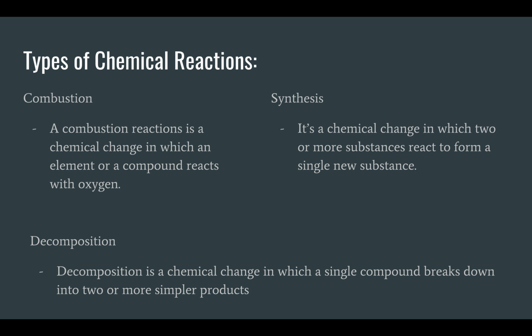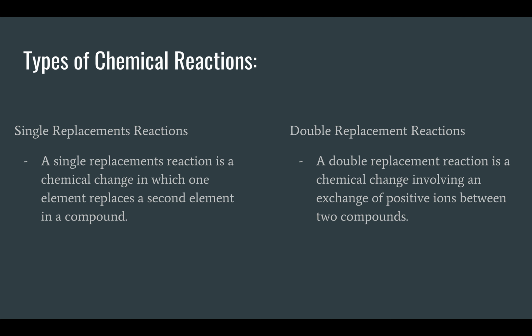A single replacement reaction is a chemical change in which one element replaces a second element in a compound. You can identify a single replacement reaction by noting that both reactants and products consist of an element and a compound. A double replacement reaction is a chemical change involving an exchange of positive ions between two compounds.